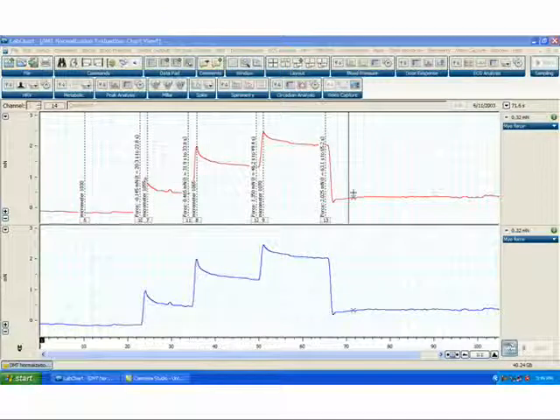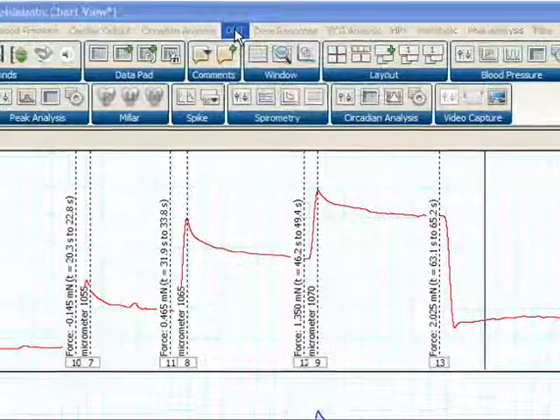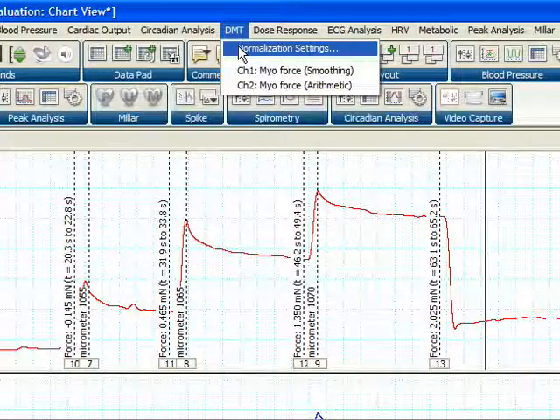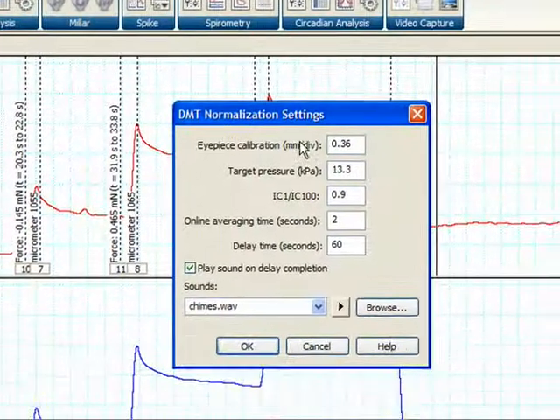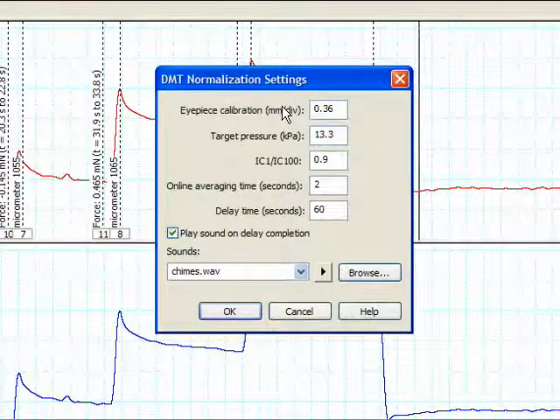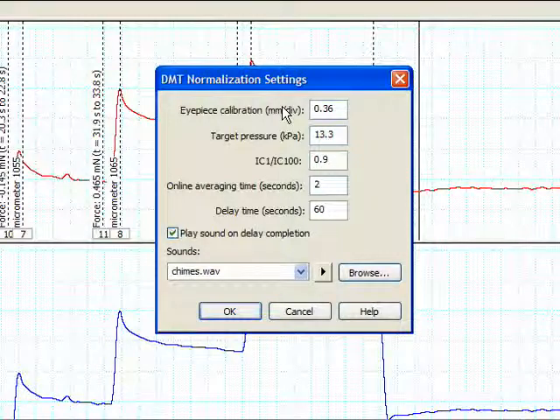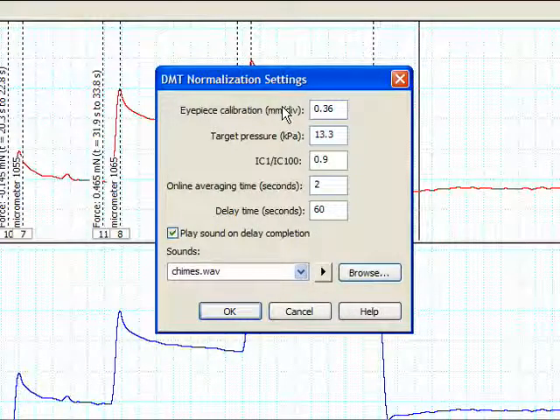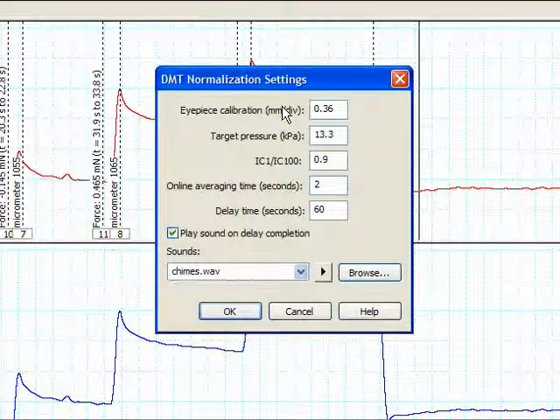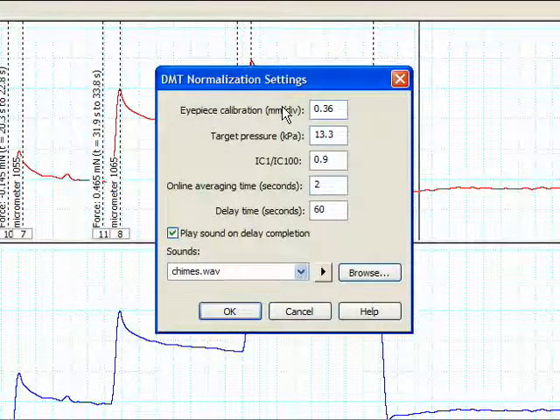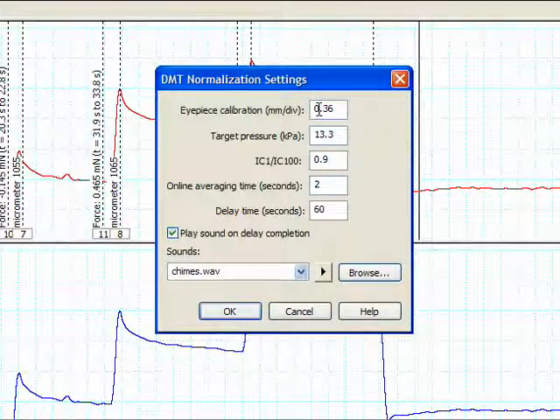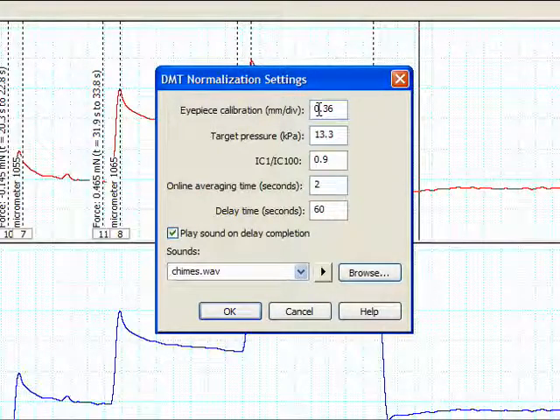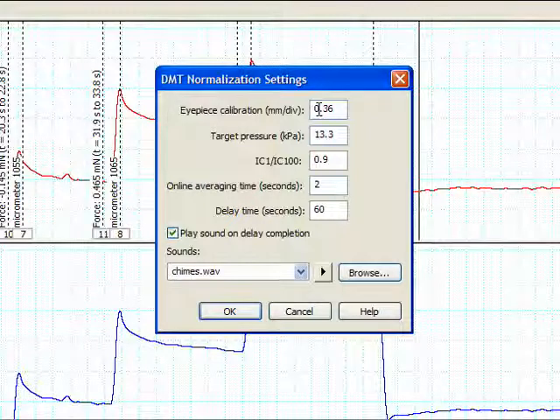In order to properly use the DMT normalization module, we first must configure the DMT normalization module settings. The first parameter in the DMT normalization settings is the eyepiece calibration. To calculate the vessel wall tension for a given pressure, and therefore the normalized internal circumference of the vessel, the DMT normalization module needs to know the vessel length. Vessel length is measured by using a calibrated eyepiece with the dissecting microscope. This is where you enter the calibration value for your eyepiece in millimeters per division.